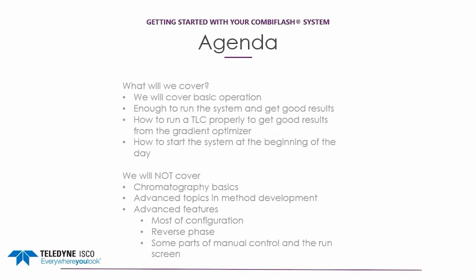We will generally limit the discussion to normal phase because other types of chromatography aren't run as commonly in automated flash systems. We will not discuss troubleshooting or solving problems in too much detail either, as this is a beginner's webinar.